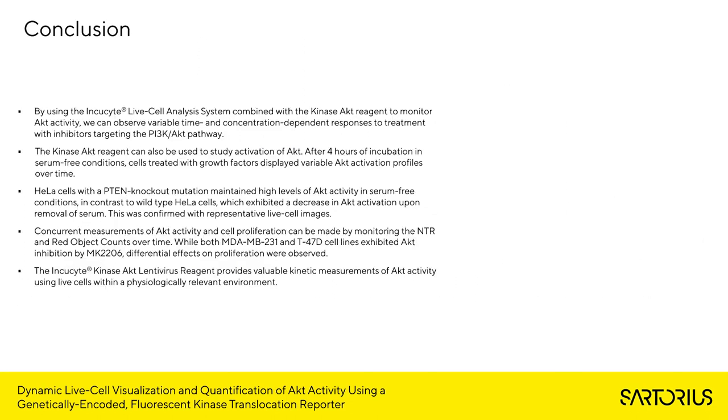In conclusion, by using the IncuCyte live cell analysis system combined with the kinase AKT reagent to monitor AKT activity, we can observe variable time and concentration-dependent responses to treatment with inhibitors targeting the PI3K AKT pathway. The kinase AKT reagent can also be used to study activation of AKT.